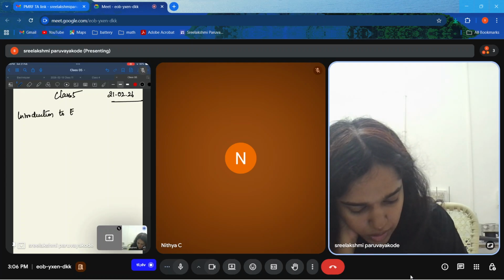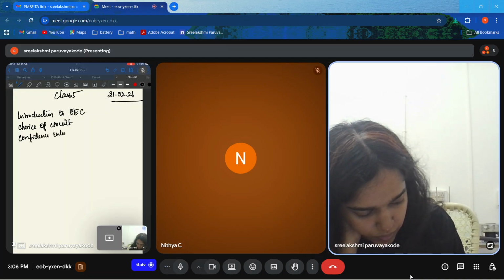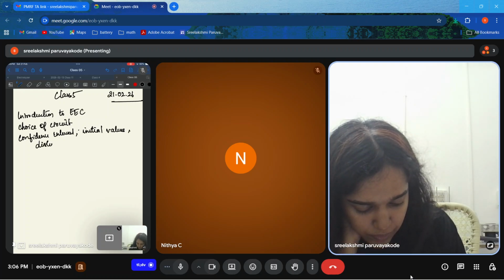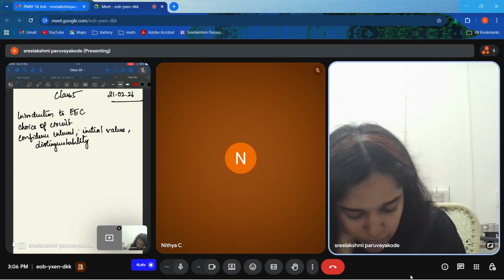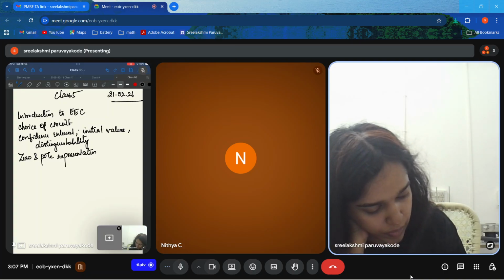introduction to equivalent electric circuit, EEC is equivalent electric circuit, then choice of circuit, then confidence interval, initial values, distinguishability, zero and pole representation, RT, RP.